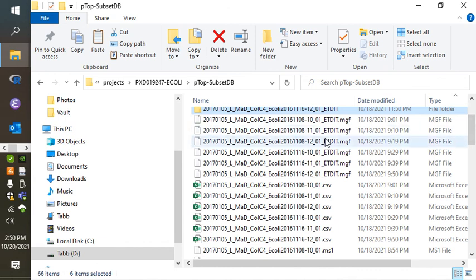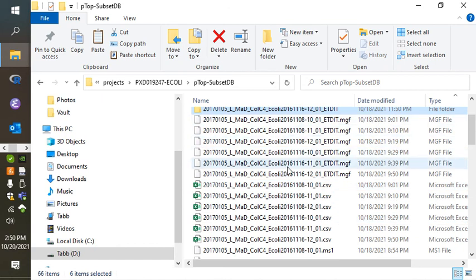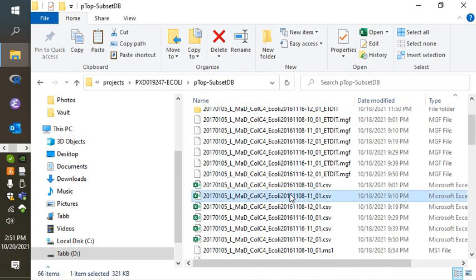I think many people understand that MGF files are intended to communicate tandem mass spectra to search engines. I believe that these MGFs represent the deconvoluted spectra after pparse processing, which is awfully valuable. There's also information recorded in tabular form to describe these individual raw files in the CSV files. These are not search results per se, but they do tell us about the spectra that we collected.